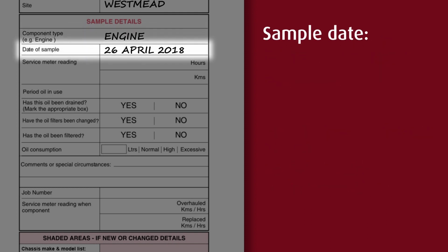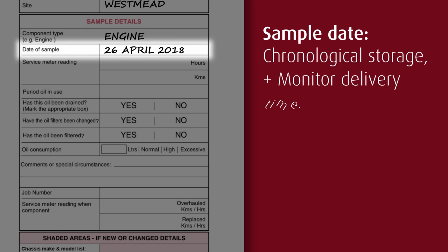The sample date is more for your record keeping, but it allows the samples to be stored in chronological order. It also allows you to monitor how long it takes for the sample to arrive at the laboratory, as an analysis date is given on the report.